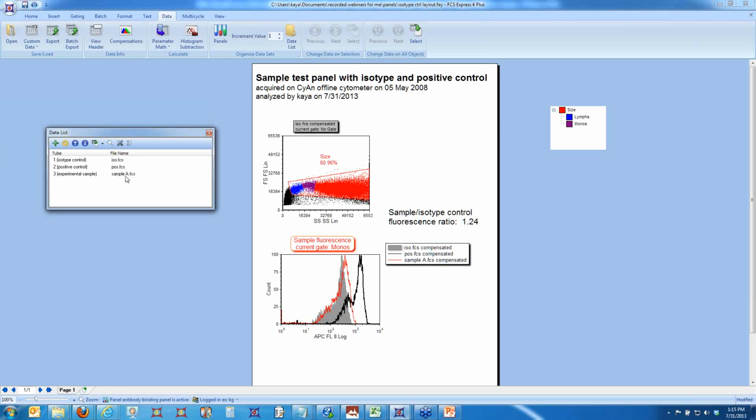Okay. Are there any questions about that? If you needed to reorder those, you could easily do so by mousing over these blue up and down arrows, and it says move selected files up or down. Okay. So now, before we load in our next iterations, I just want to show you that after you've defined a panel, it's very easy to amend the panel, so there's a lot of flexibility here.